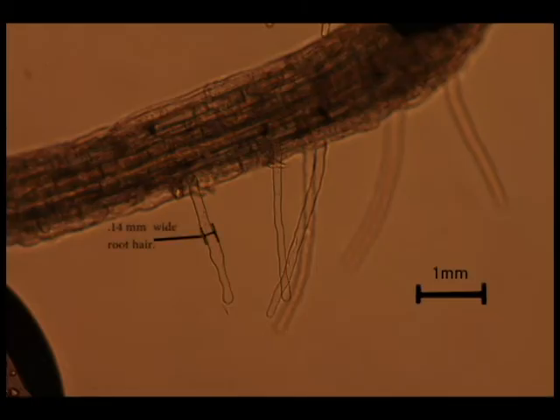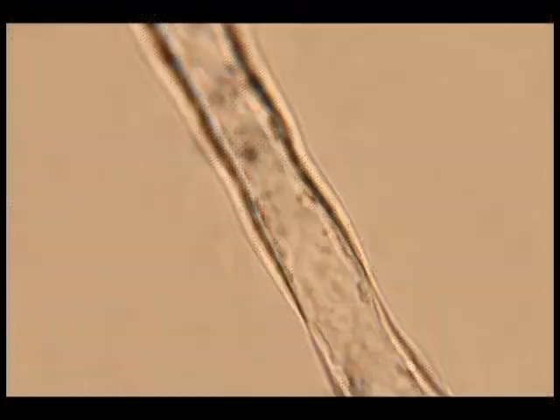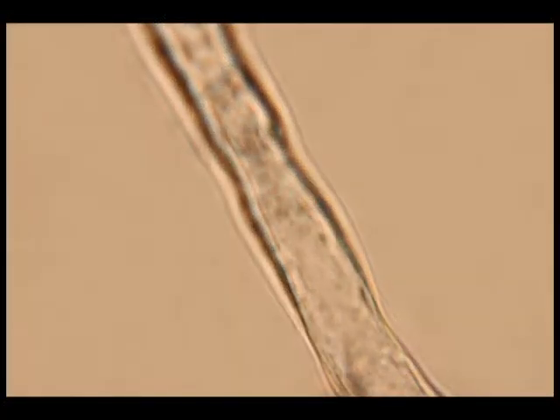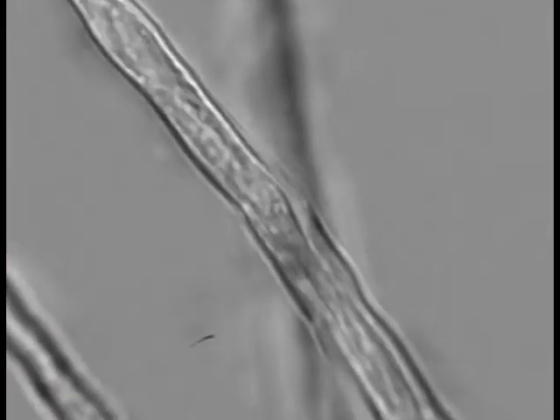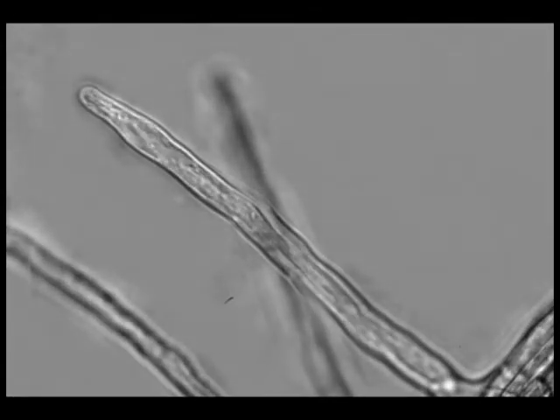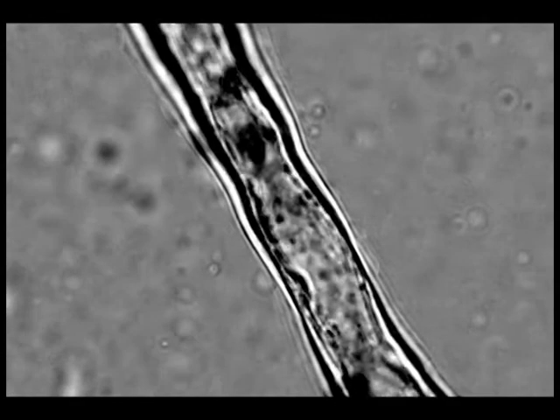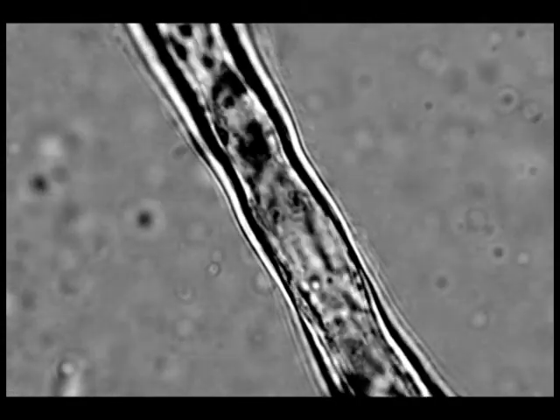Now here's an image of light microscopy. This was a 4 times image that we'll zoom into, going into a 40 times image and then a 100 times image. From here we'll go into a video of light microscopy streaming in a 40 times image, and then zoom back in to show you a 100 times image of the streaming with enhanced contrast.